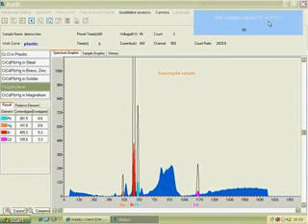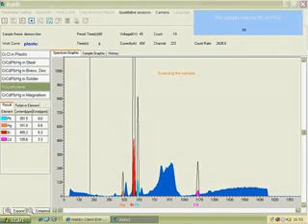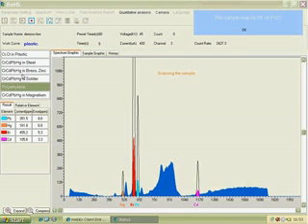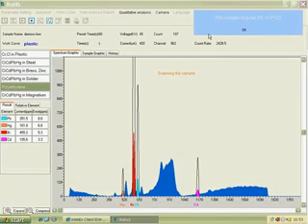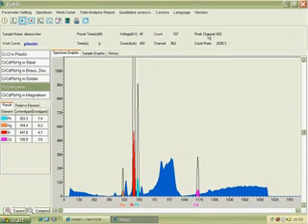All those would be named here, so if you were in PVC or PE and needed to change it, you could literally change it on the fly and start your analysis over.